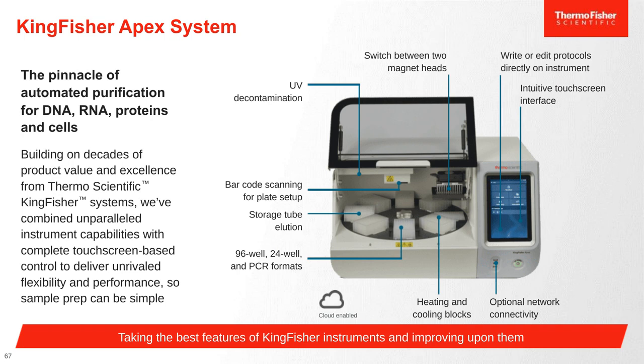Then our next question is, what is the full workflow time, hands-on and instrument, for both the vaginal and urinary tract workflows? I can take this one. For the full workflow, from once you have the sample till you're able to get results off the instrument, it is 8 hours or less.